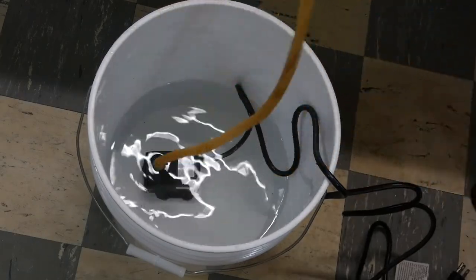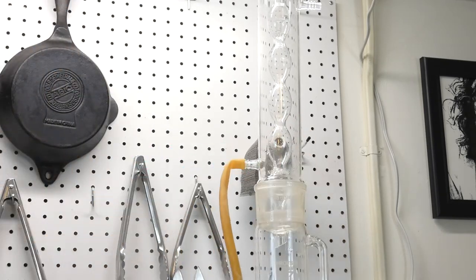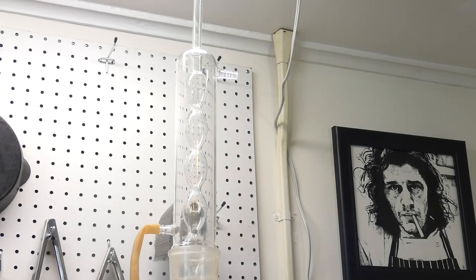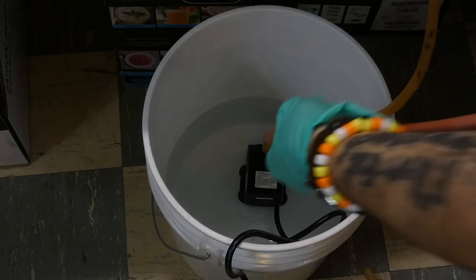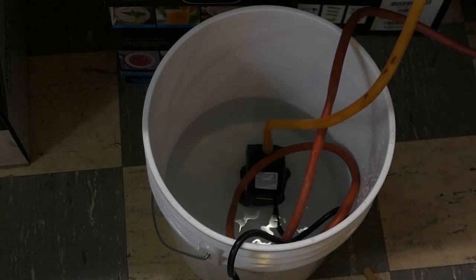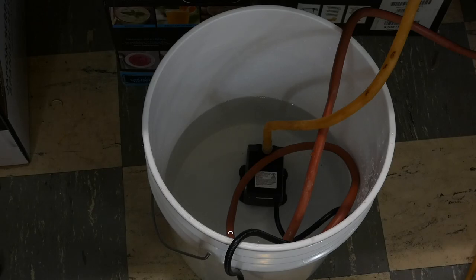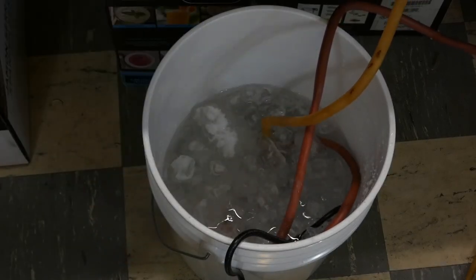And you're just gonna connect this tube to the bottom part of the condenser. And then we're gonna take the other hose that we have here and connect it to this end like so. And then we're gonna pop that end into the bucket. And that will create a full recirculation so that we're not wasting any water whatsoever. This is also the time where you're gonna grab your bag of ice and pop the whole thing right into this bucket. You want this water to be extremely cold because that aids in the condensing of the ethanol.